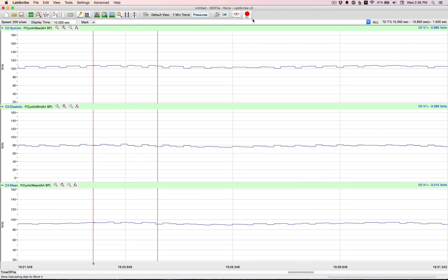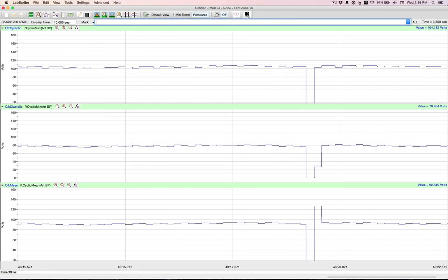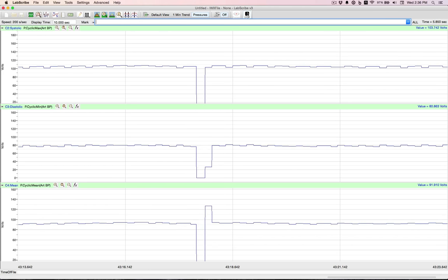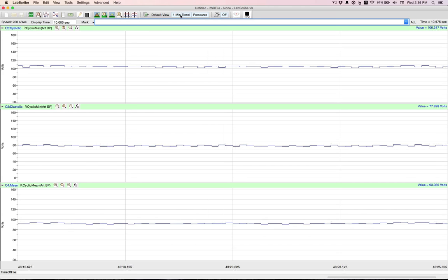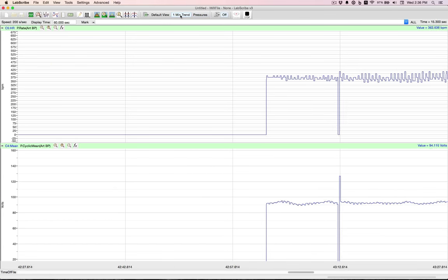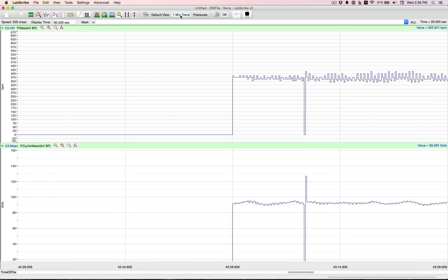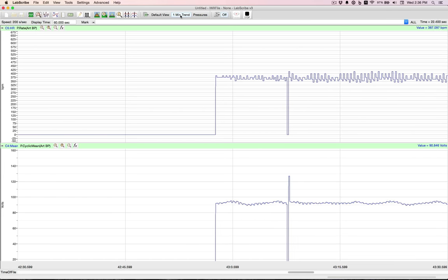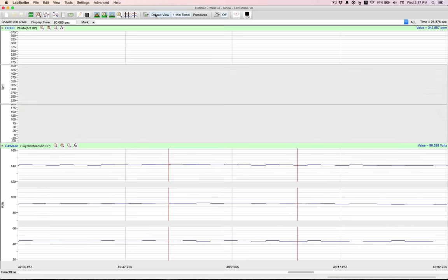And these are even available while you're recording. So we'll start the recording. We will switch over to our one minute trend. And then finally, back to our default view.